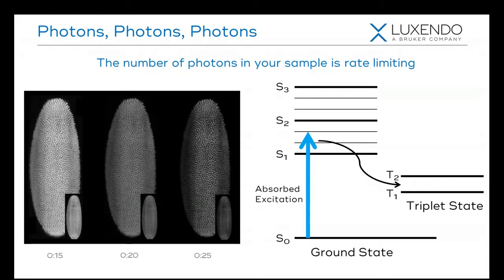Not only does this consume the fluorophore and essentially remove fluorescence from the signal that we're able to detect, but this can also generate reactive oxygen species which can stress and or kill your cells. So the question for everyone when you're doing a light microscopy experiment, and the most important thing to think about, is how do you make the most of this limited photon budget?